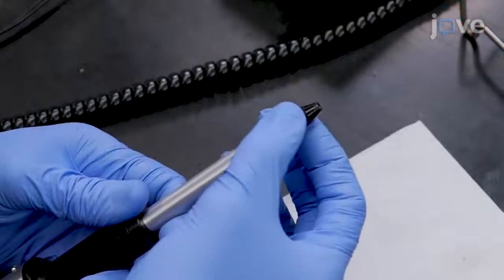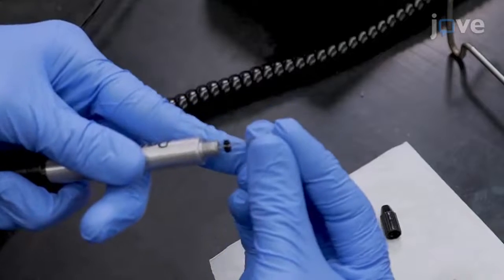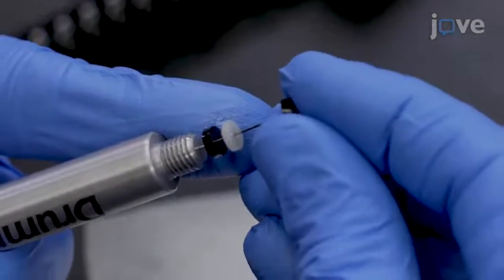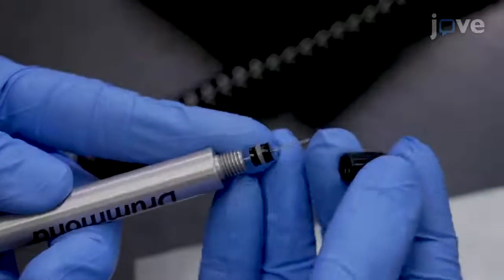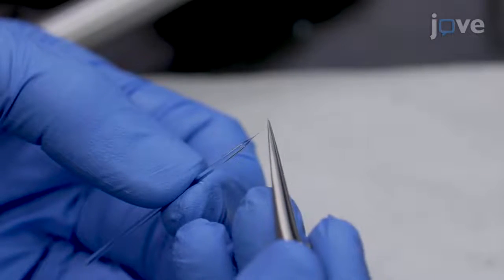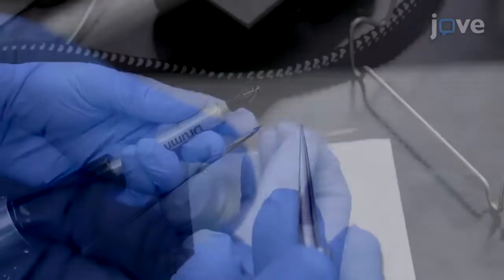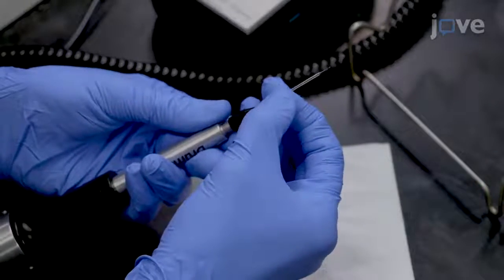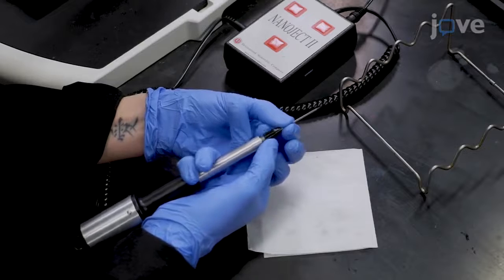Remove the collet and place the sealed O-ring with the indentation facing up. Place the larger O-ring onto the metal plunger. Then reattach the collet without tightening. Insert the metal plunger into the blunt end of the oil-filled glass needle and gently push it down, inserting it into the larger O-ring. Then tighten the collet until secure.